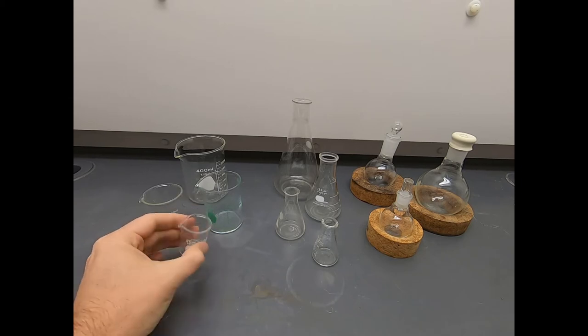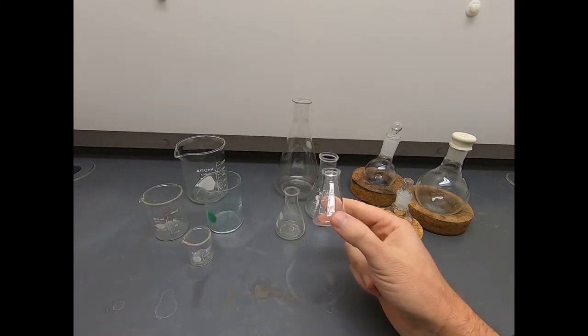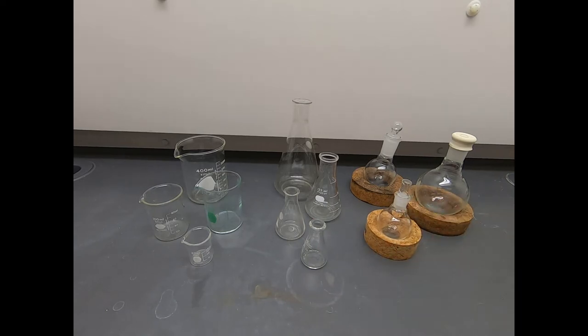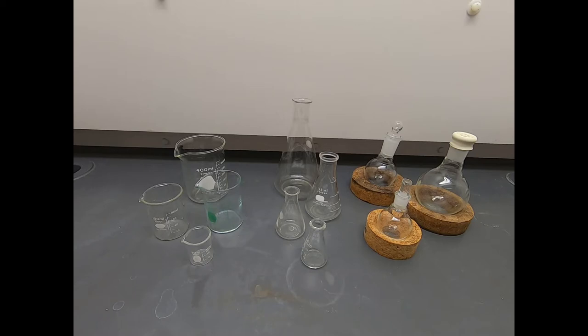For the most part, these are by far the most common types of glassware you encounter. On the left, we have beakers. In the middle, we have Erlenmeyer flasks. And on the right, we have the round bottom flask. Let's talk about what these are and what the most common use cases are for these types of glassware.